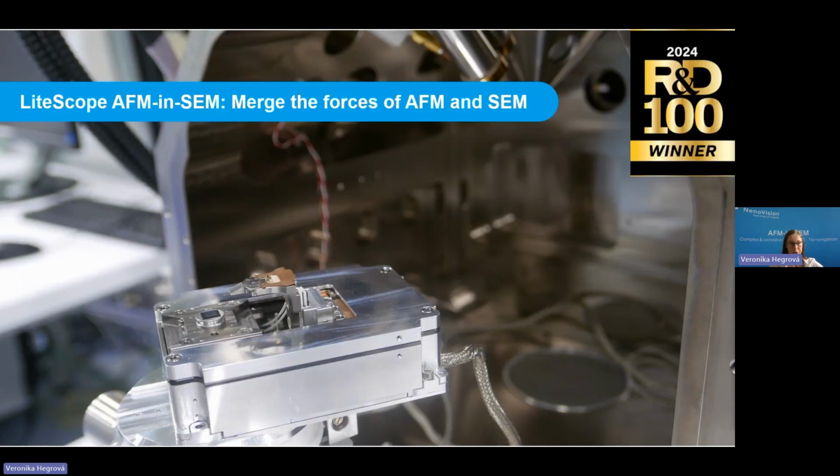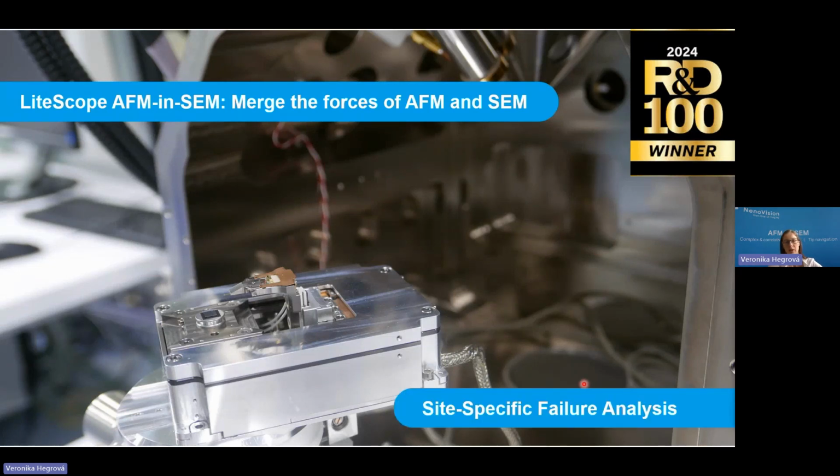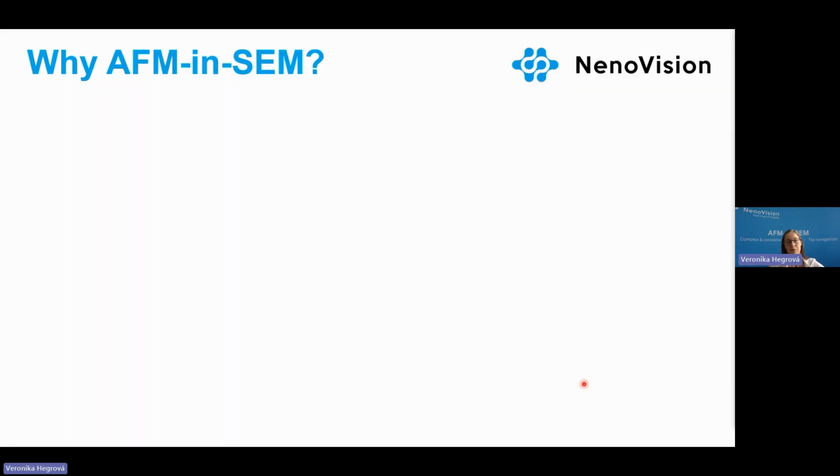So when we merge them together, what we see over here is the AFM LiteScope head sitting on the SEM stage, and behind it, now with the chamber open, is the SEM. And so how it can be useful for the site-specific failure analysis.